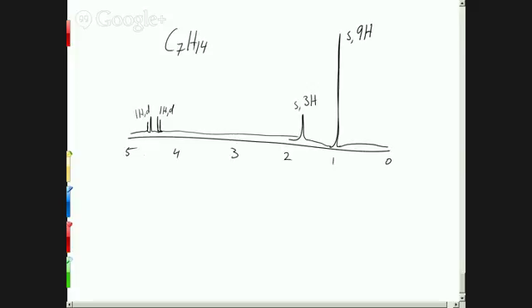The doublet has 1 hydrogen splitting? Yeah, so that means that it's 1 hydrogen and 1 neighboring hydrogen. The 1H tells us that that group is 1 hydrogen. The doublet tells us that there's also 1 next to it. So that's splitting, right? Yeah, that's the splitting. And in the book they say closely spaced doublet, just because you can't actually see that it's split. So it's telling you it's a doublet in the book. We're going to do the same thing.